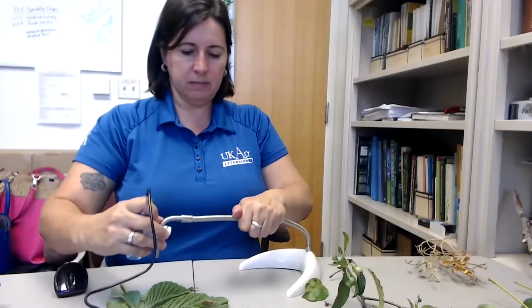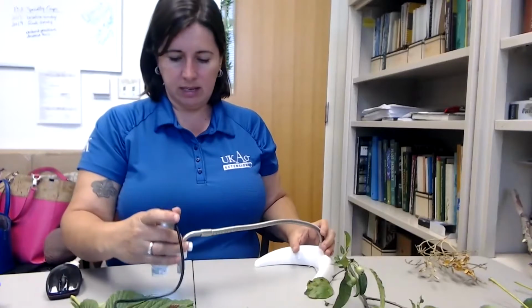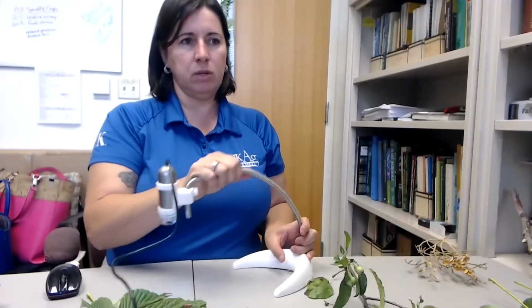If you do want to use it, I'll get my leaf again. So you can definitely do some squeezing. This is really easy to maneuver, and you can get it down low. Okay, so you can use it. It takes some practice. It's not quite as handy as the other one.